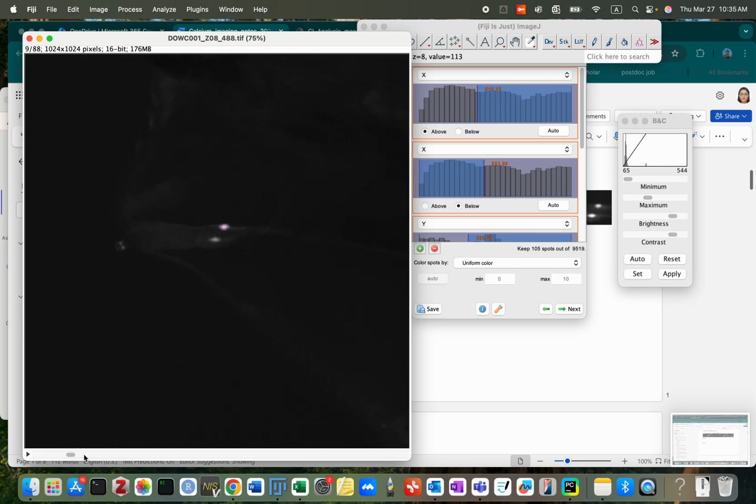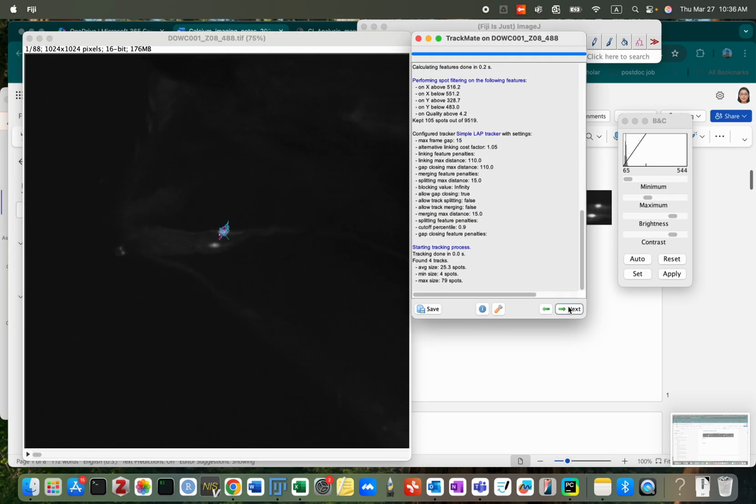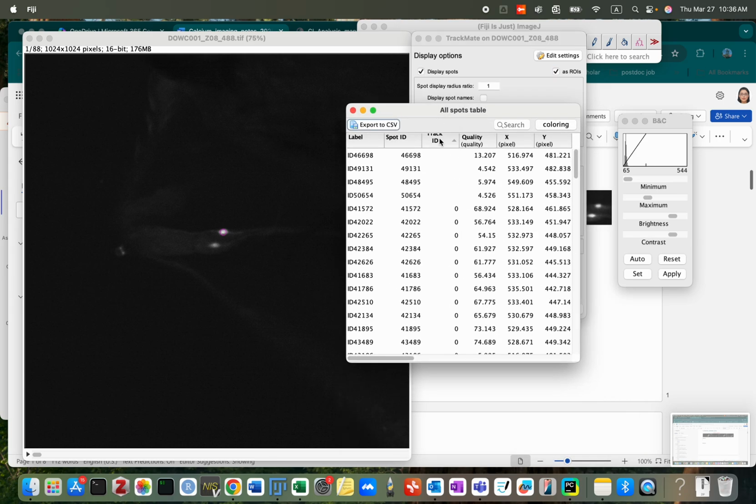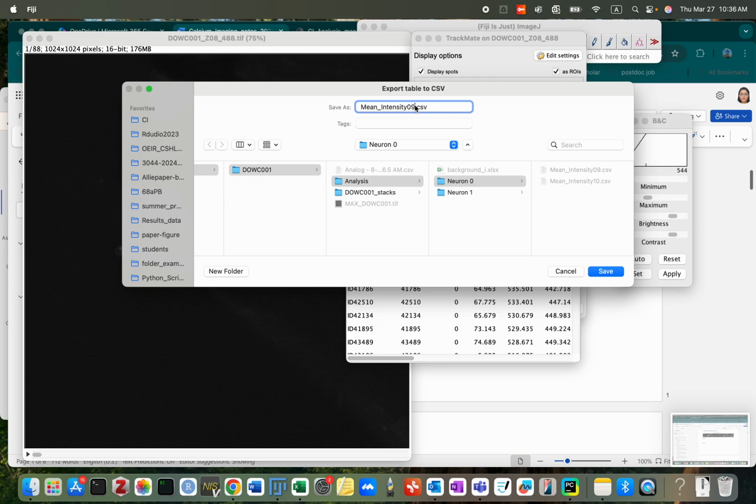Let's see. You want to make sure you have some extra wrong selection. That's okay. We will clean the Excel, what you see I did many times. But you want to make sure all the neuron 0 is selected. Okay. Sort by checking ID. And export. Now we are working on number 8.